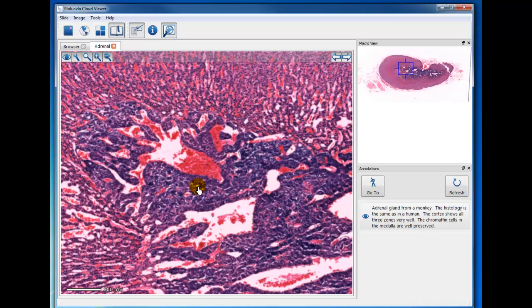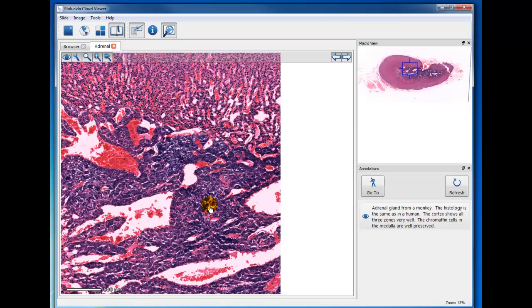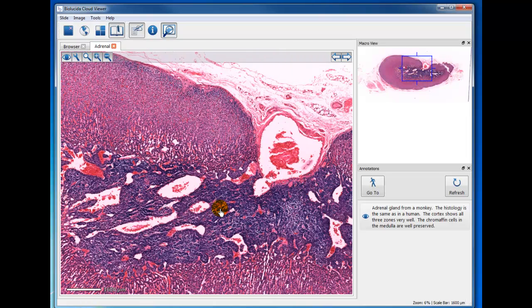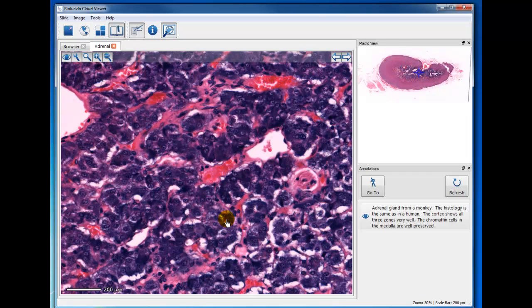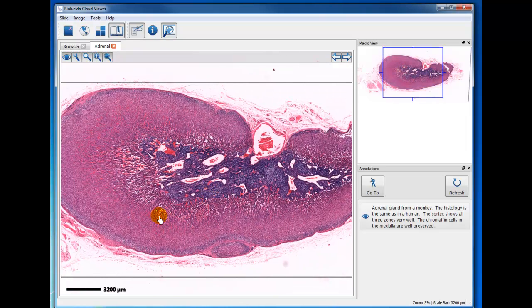And you notice the large blood vessels because the adrenal gland depends upon a very robust blood supply as well as a robust drainage. And so the discharge of the catecholamines, for example, in an extreme stressful situation, can get in the bloodstream very quickly and increase heart rate and do all kinds of things like the fear and the flight reaction. So use your lecture and come back and try to put this gland in context and the endocrine glands and its relationship to how the pituitary cells affect this organ.